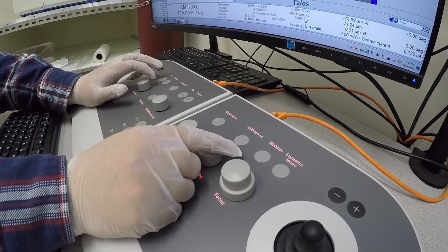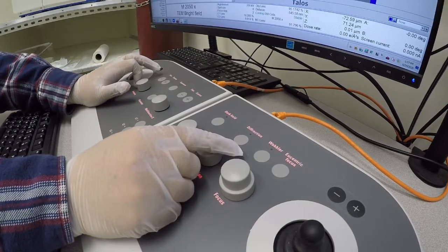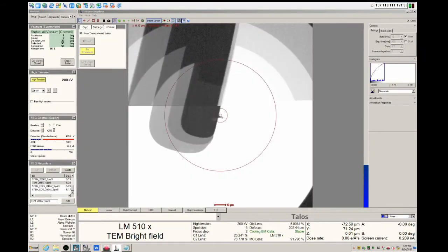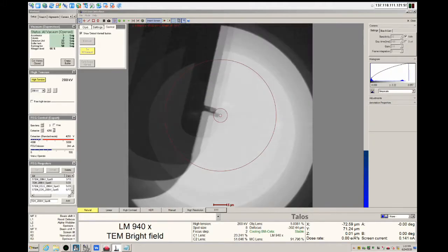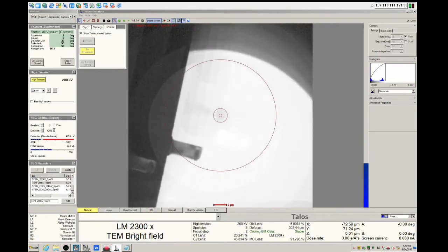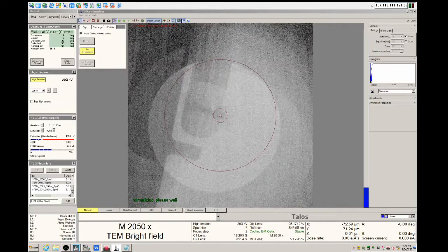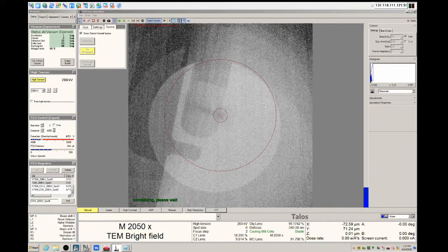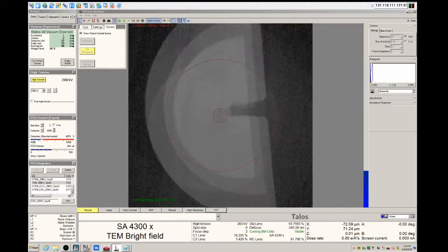By adjusting the intensity and magnification dials simultaneously, you can zoom in on your sample area of interest. It is normal for the image to flip at certain magnifications. Also be patient while the system acquires the image. Here we are seeing in real time how long it sometimes takes for the phosphor screen and camera to adjust.